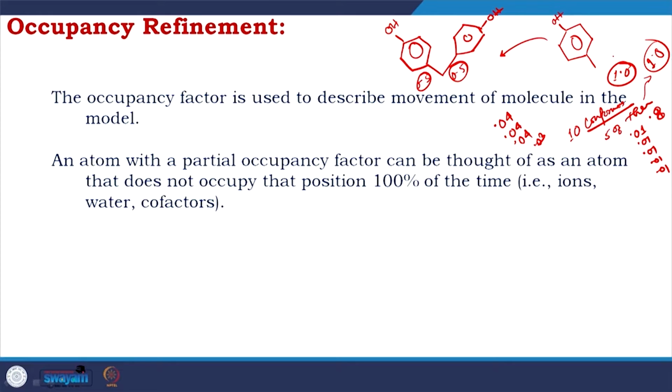So, you would benefit from knowing the contribution of conformations, because some of the conformations which are not contributing to higher stability might play an important role in the development of the transition state, intermediates and things like that.